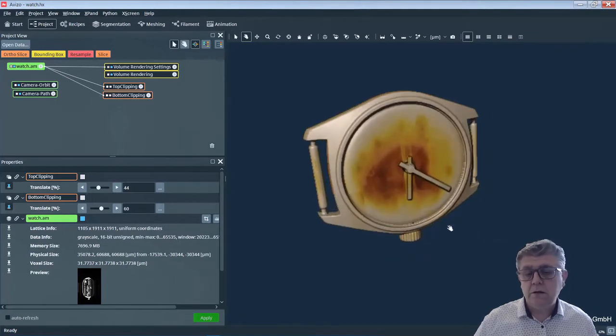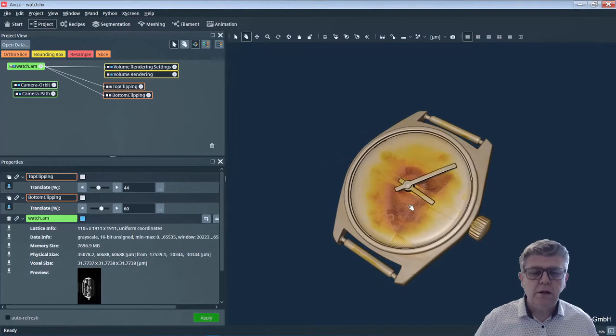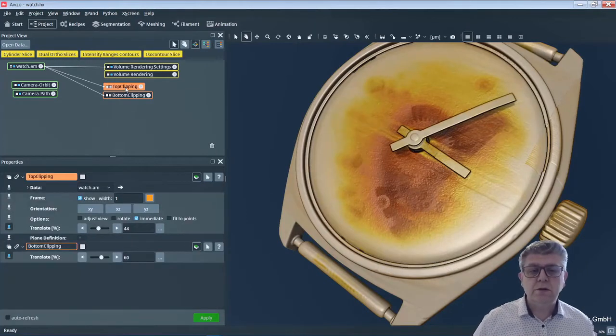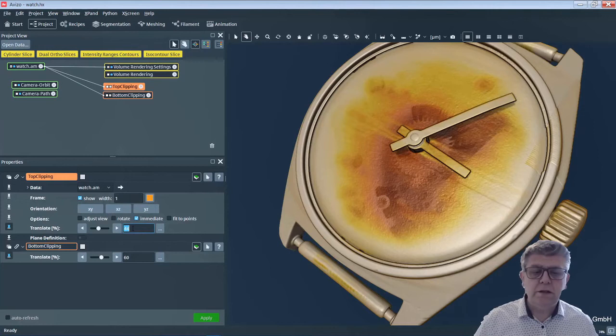Why? It's quite simple to explain. Avizo tries to give you the best quality with the memory you're allowed to use on the specific viewpoint you have. So if you zoom in, it's going to concentrate the best quality on the zoom in. If you zoom out, then you will see for a while that Avizo has to adapt.